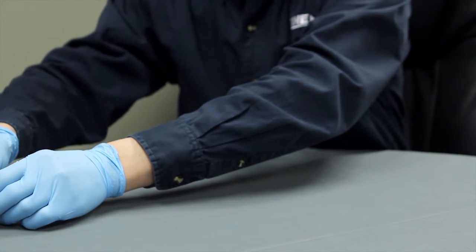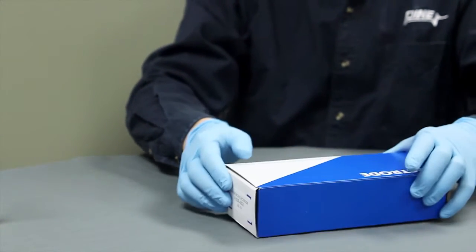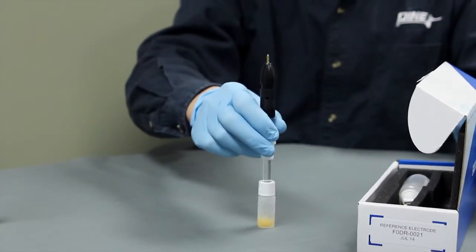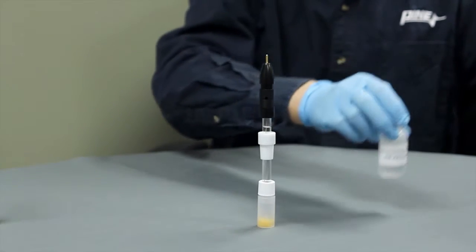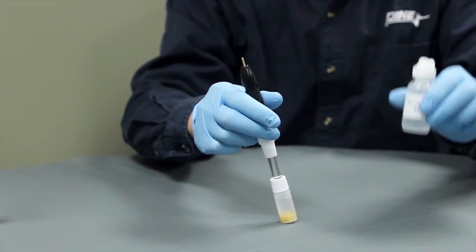Let's talk about how to use this one in aqueous solution. First, we'll go over what comes in the box. You get the electrode, the electrode storage bottle, and a bottle that contains filling solution.